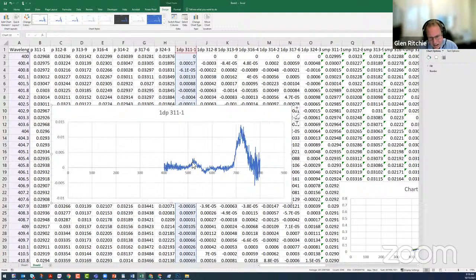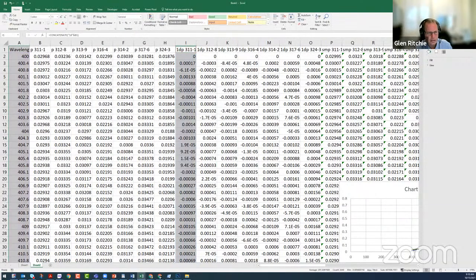So you can still kind of see this general pattern that we have here, but you see a lot of stuff going on that is really due to those individual noise measurements and are completely independent of anything else. If we could completely eliminate the noise from both our standard and from our reflectance measurement, you wouldn't see that at all. So one of the methods that we use is spectral smoothing.